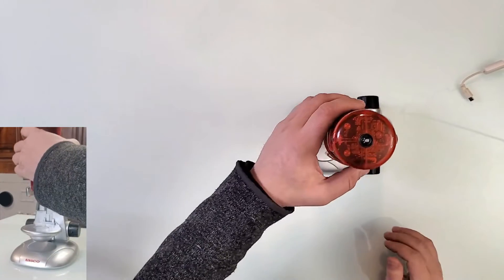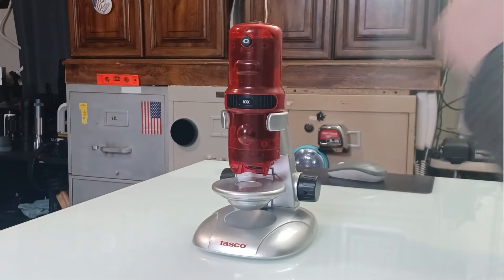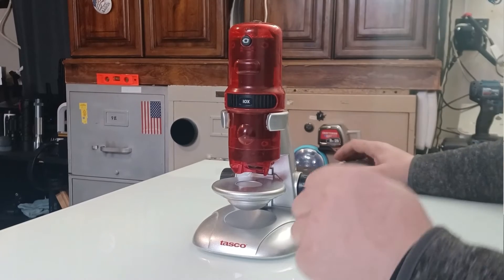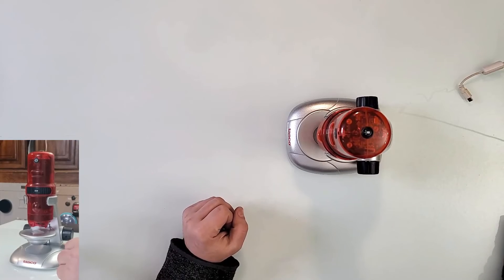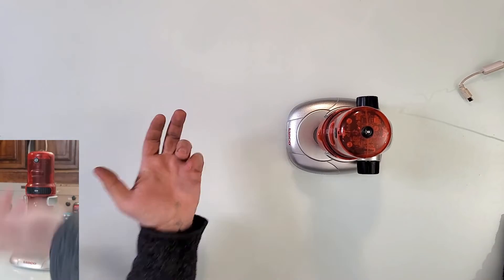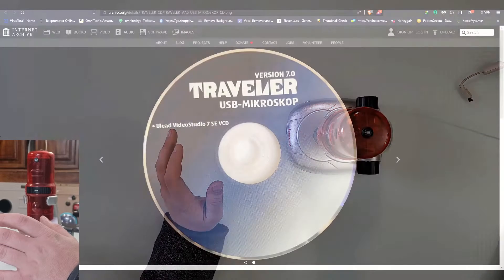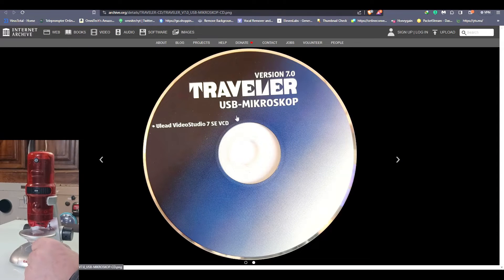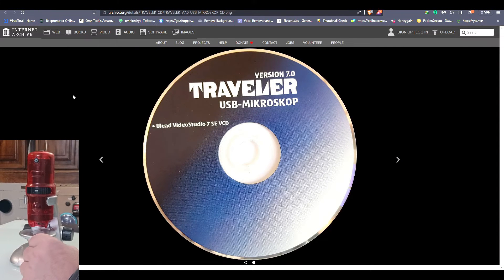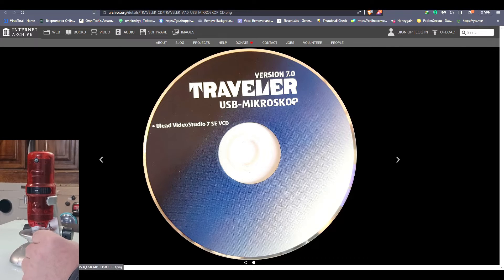Let's get to the point of how I got this working. It was not the most straightforward thing I ever done, but there is a way. As you see right here on my screen, this was an archive that somebody had posted the entire CD.